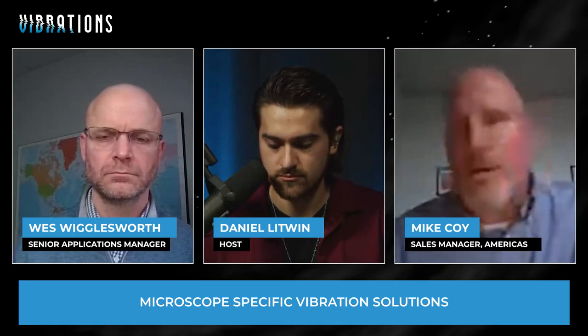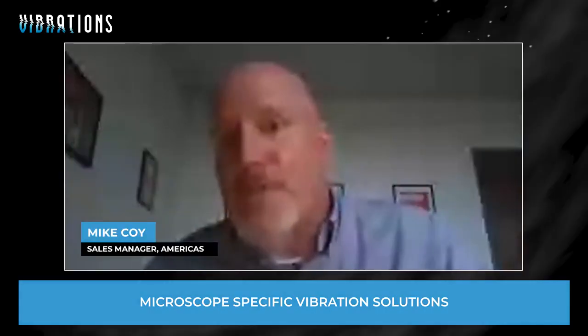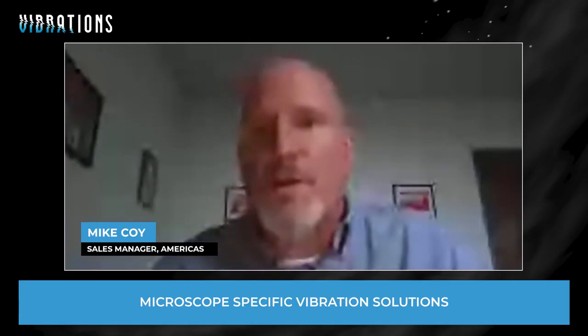All of the microscope manufacturers are capable of doing that on their own. Sometimes they come to us and ask us to do it. We have a slightly higher level of expertise. And they have very well developed specifications for what an environment has to be like to know that their microscope will be successful. So they absolutely have limits of vibration, of magnetic fields, of acoustic noise.